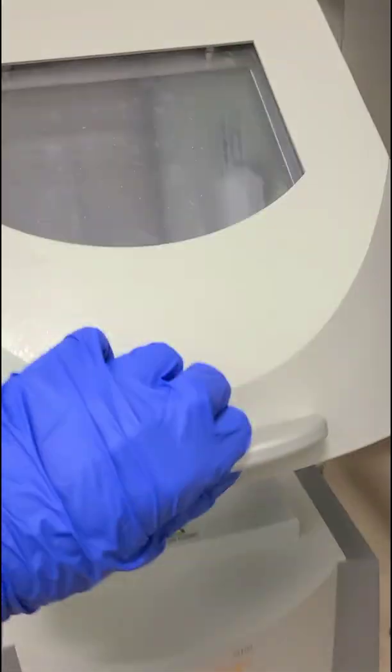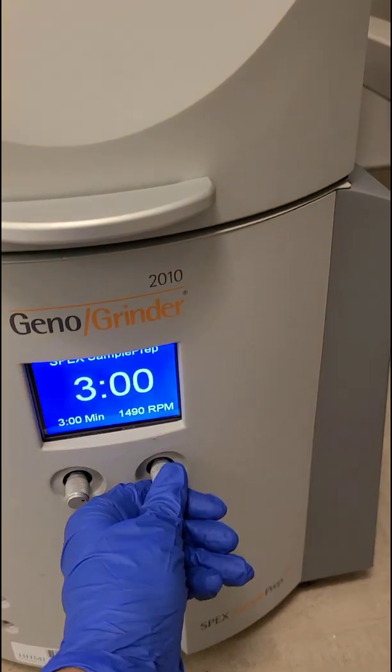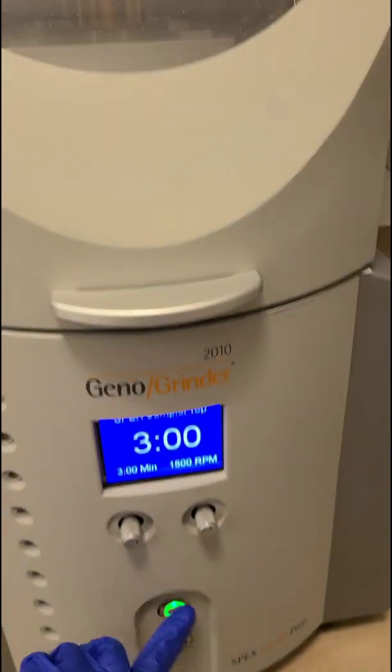Looks good. Close that. Three minutes good. Fifteen hundred. It's gonna be kind of loud. Off it goes.